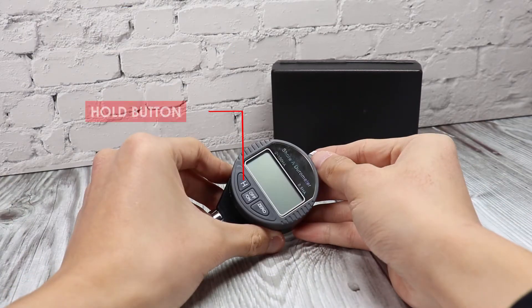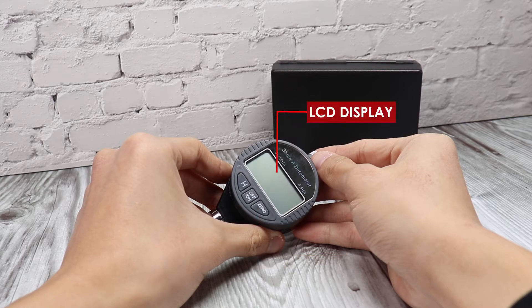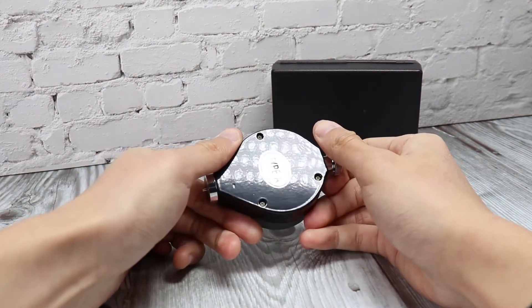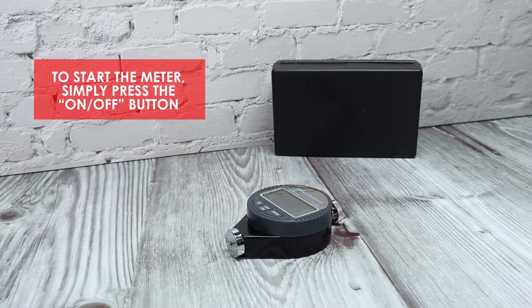Parts: Hold button, On and Off button, Zero button, LCD display, and Sensing pin. To start the meter, simply press the On and Off button.